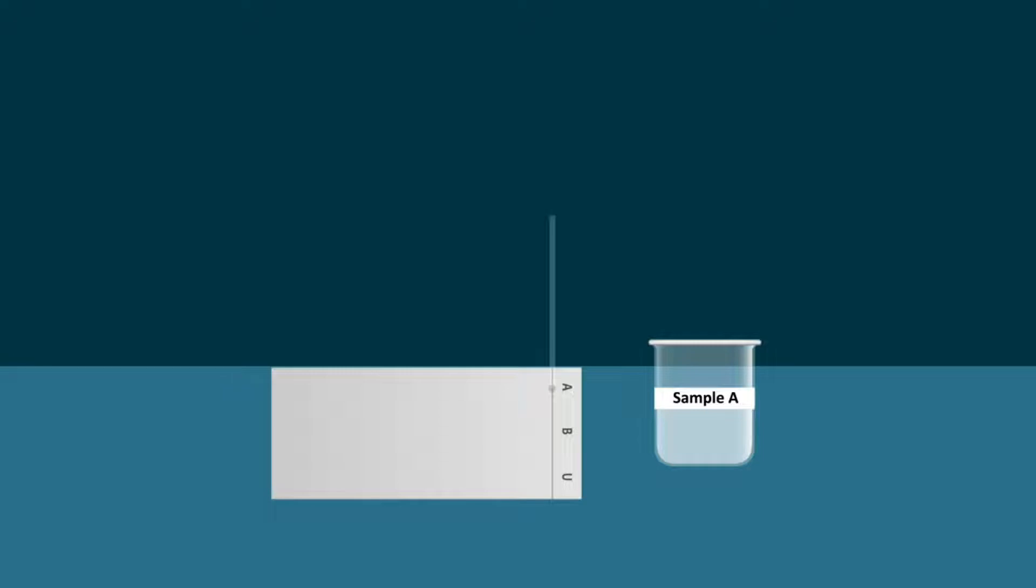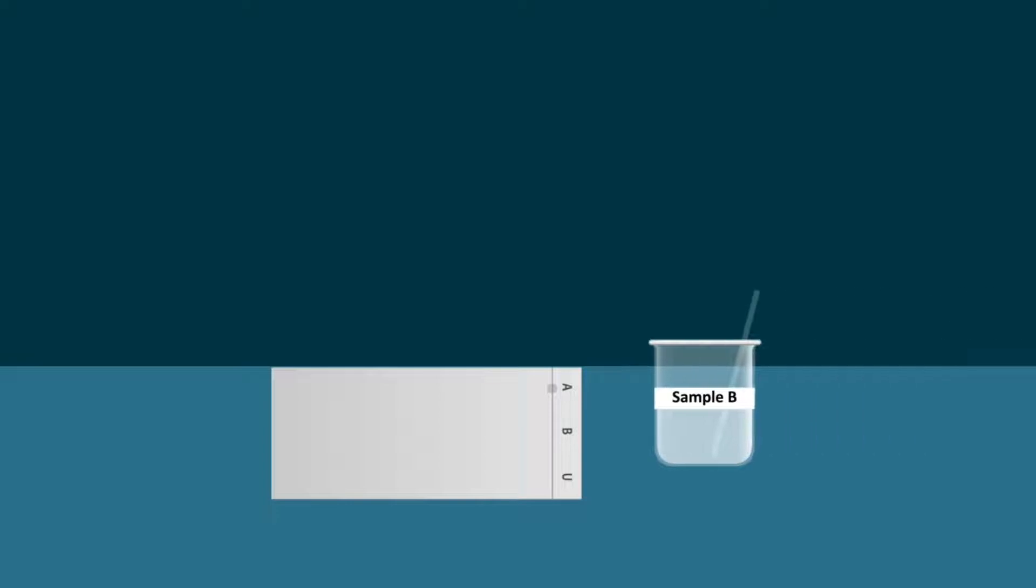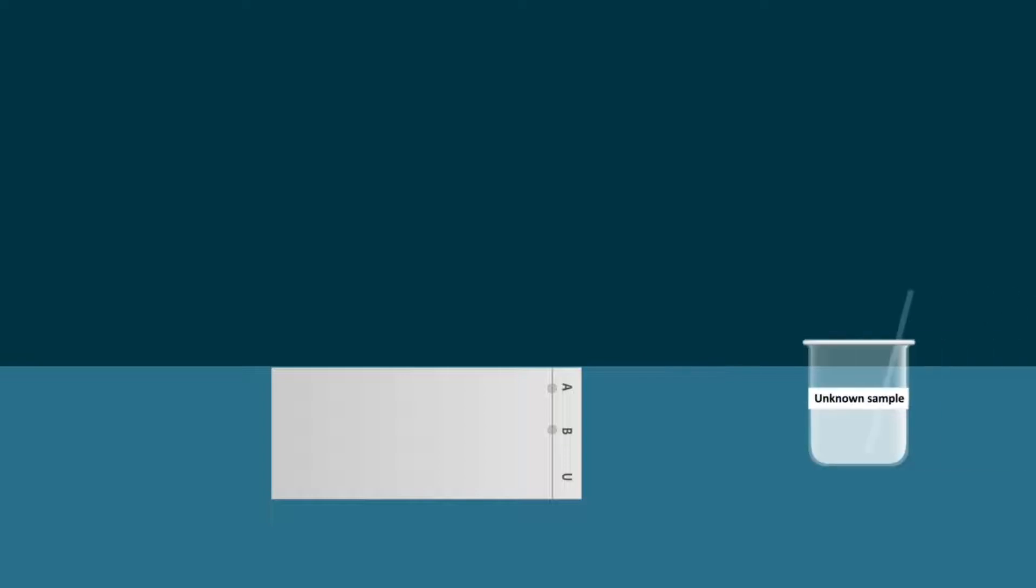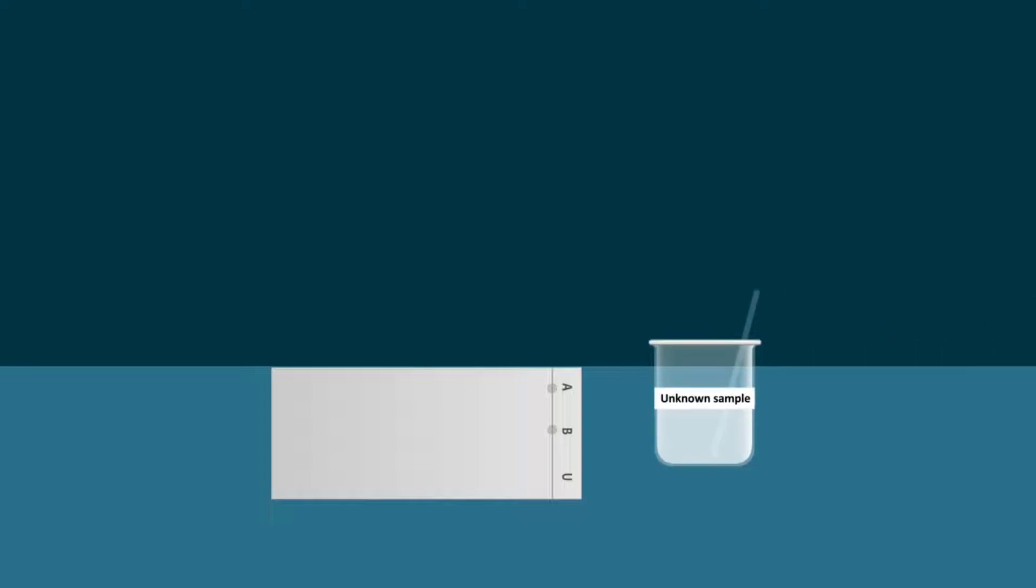Introduce sample A on one spot, sample B on another spot, and the unknown sample on another spot.